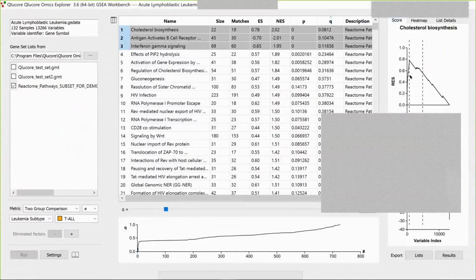But of course, the higher the enrichment score, the clearer the peak you have. So it's the normalized enrichment score that you should focus on. Based on this, my guess would be at least 1.5 or so. But I think you should Google on that or try to find some more information, because I don't have any real expertise on this.